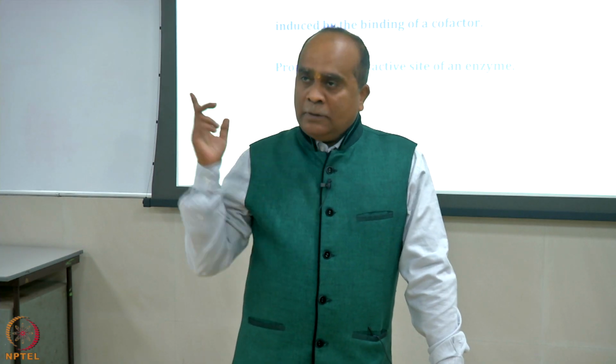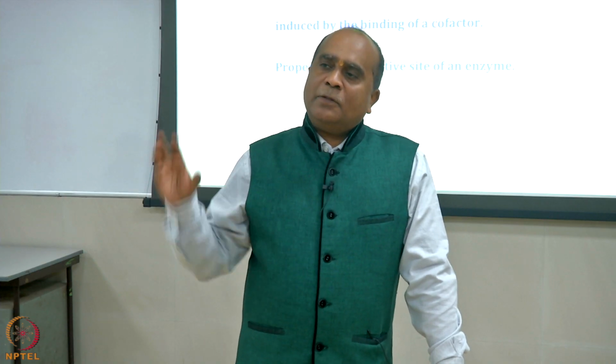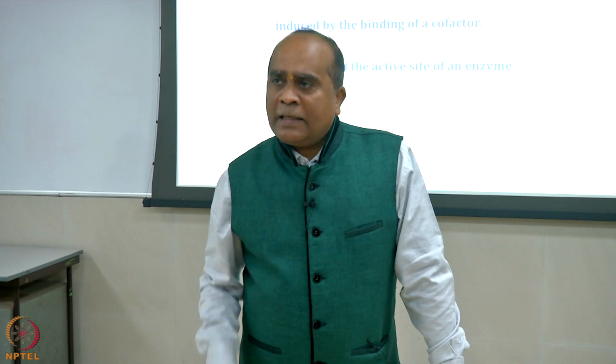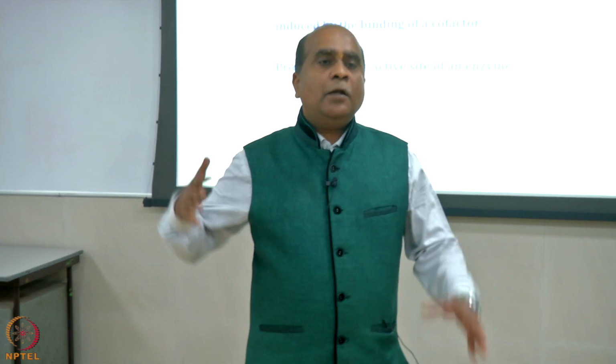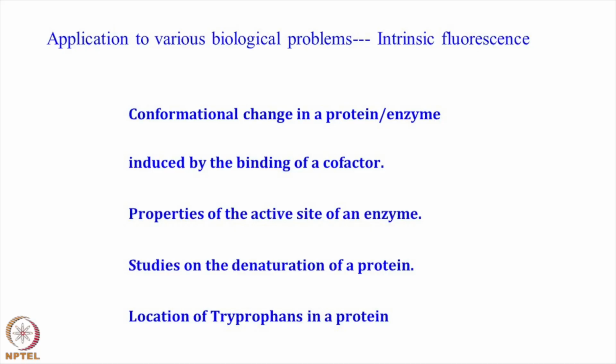All of these discoveries that I am talking about have been done because people understood how the proteins in such organisms work: conformational dynamics, understanding the conformation, and locking it in that conformation, which can be probed using fluorescence.